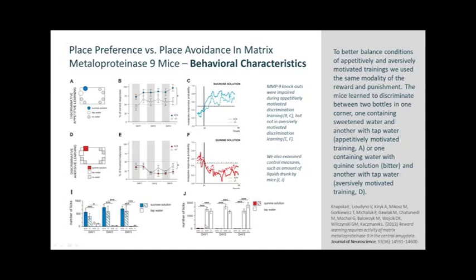I would like also to show you that it's possible to measure different aspects of behavior at the same time in the IntelliCages. In this case, we measured number of licks. It was a kind of control to show that our knockout mice drank the same amounts of sucrose or quinine as the control animals.